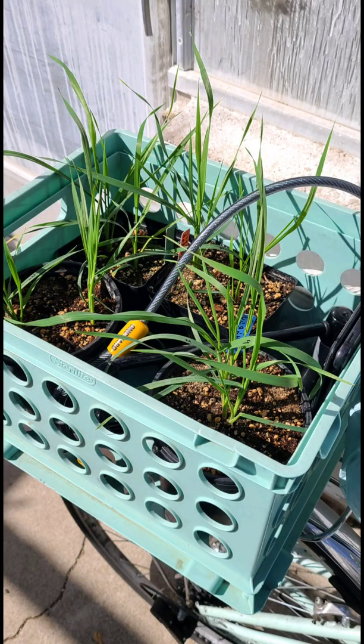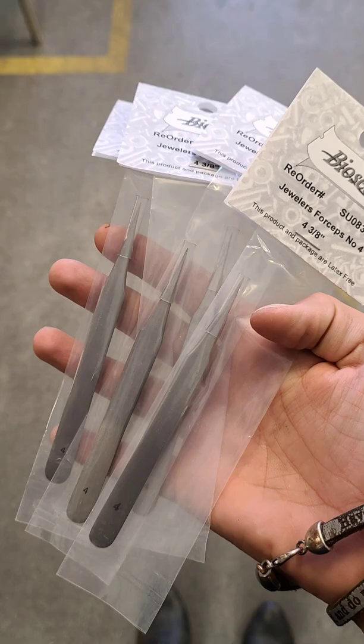And here are the 4 lucky plants that get to go on a joyride with me from the greenhouse to the lab for the dissections. On the way, though, we did have to stop at VetMed to pick up new tweezers because this is a very careful process, and the meristem is tiny, as you're about to see here.